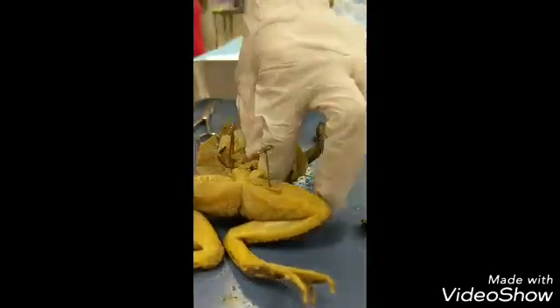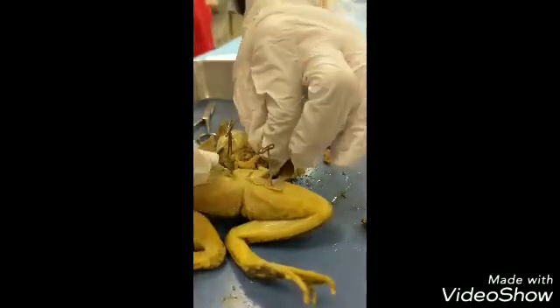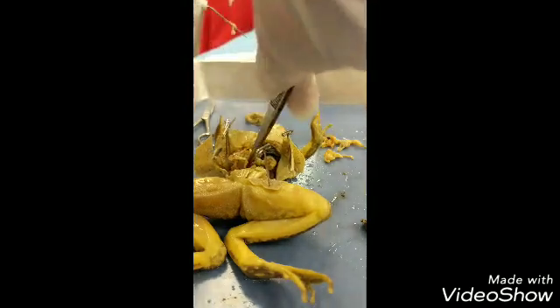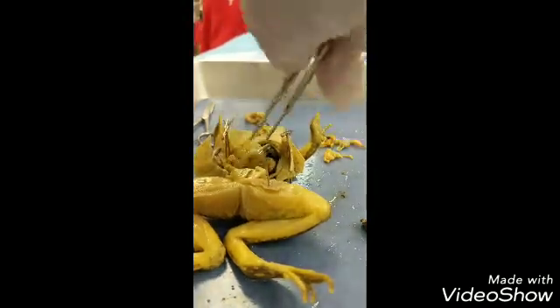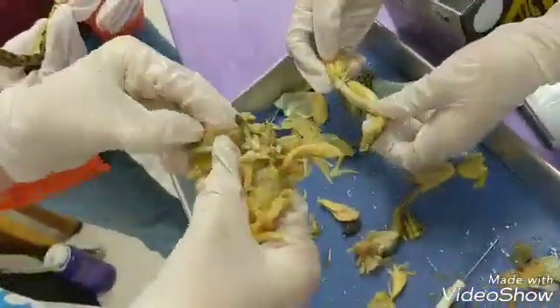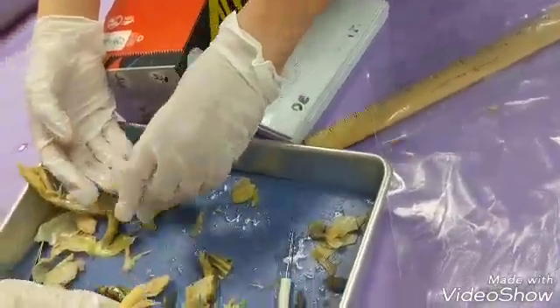Miss Holder, can you help me get this out? Listen, I can't get it. Oh, the tweezers? Use this. Okay, I'm not going to put this in there — this is just too disgusting. Let's do this. What's the spaghetti? I need to put this on the vlog. You guys seriously, like, throw it at the head or something? This is bad. Please don't demonetize me. That's the jaw. Well, that's part of it. This is what happens when you die. There are tools for a reason.